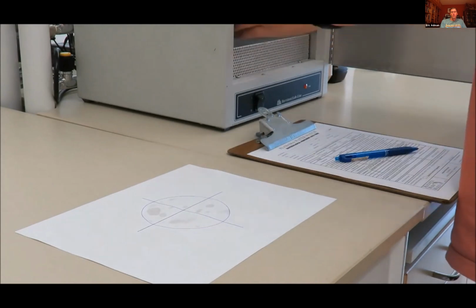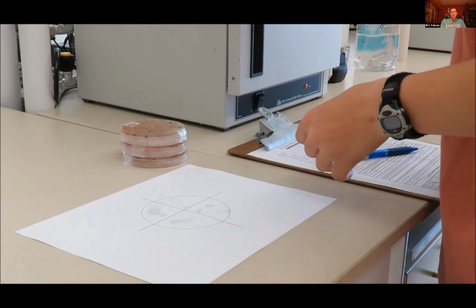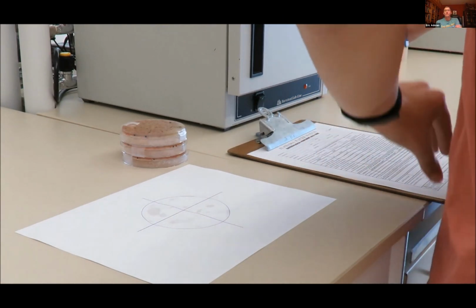Remove plates from the incubator, being careful not to spill any liquid. Be sure to record the incubation period, which is optimally between 30 and 34 hours.